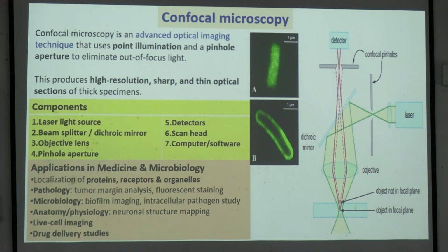Okay, again confocal microscopy, to get a more pinpoint focus from the fluorescent microscope. Again another division is there, that is the confocal microscope. The focus portion will be more in this confocal microscope, and we have a different kind of filter here. The dichroic mirror is there, but we have a pinhole filter.